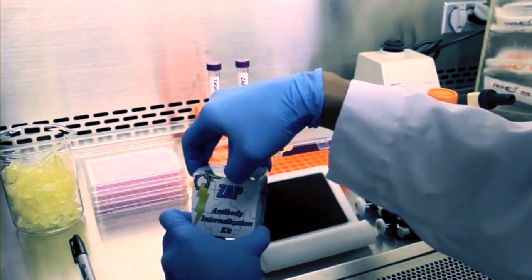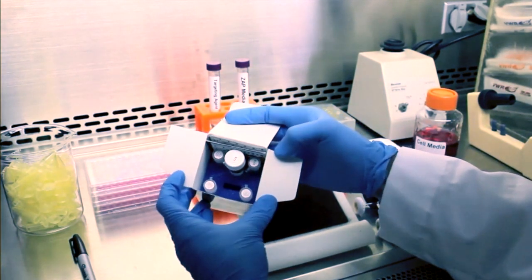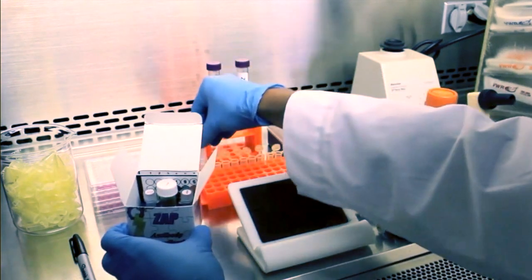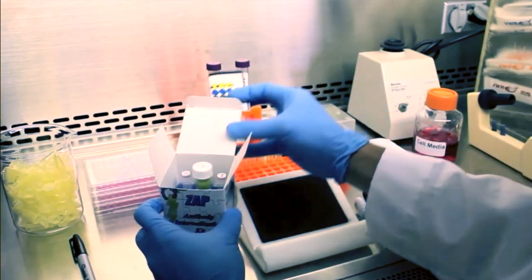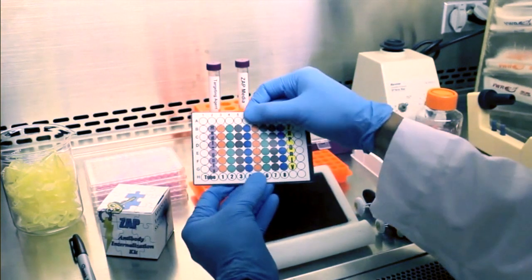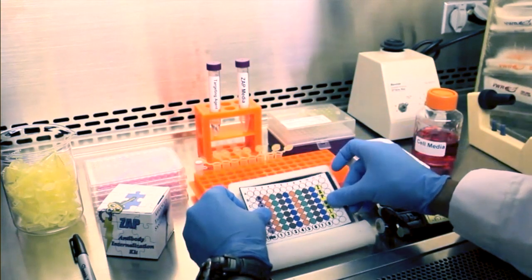Begin by opening the kit and removing the ZAP product and placing that aside. Next, remove the well template. You will notice that columns 2 and 11 are marked for the controls.